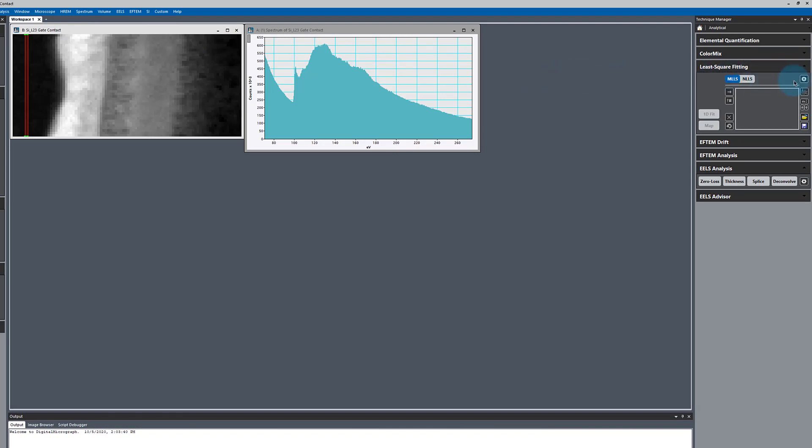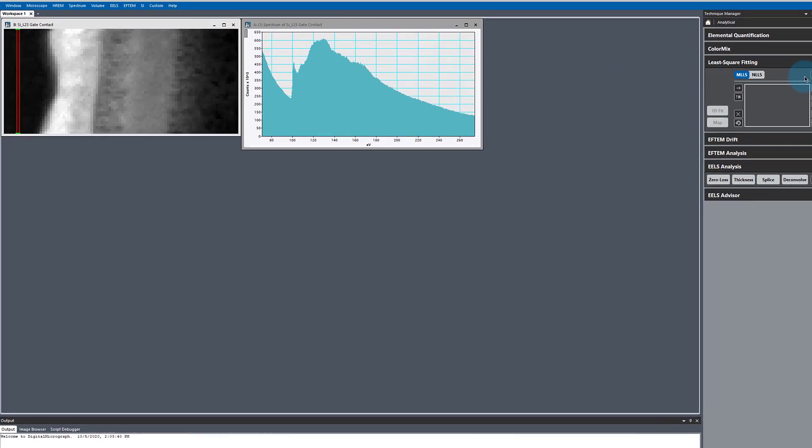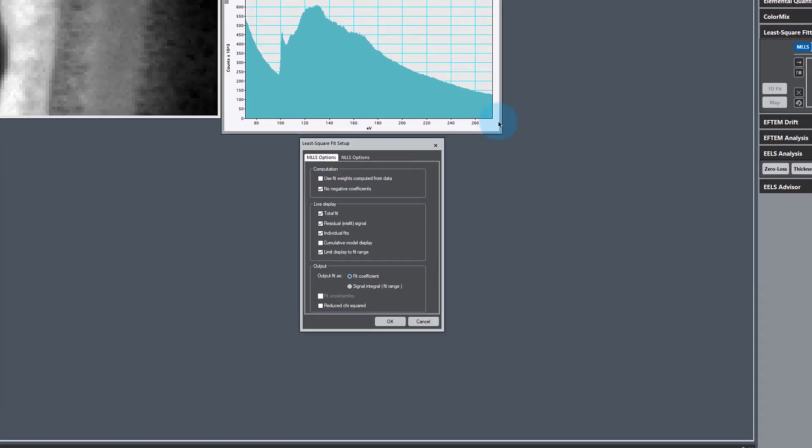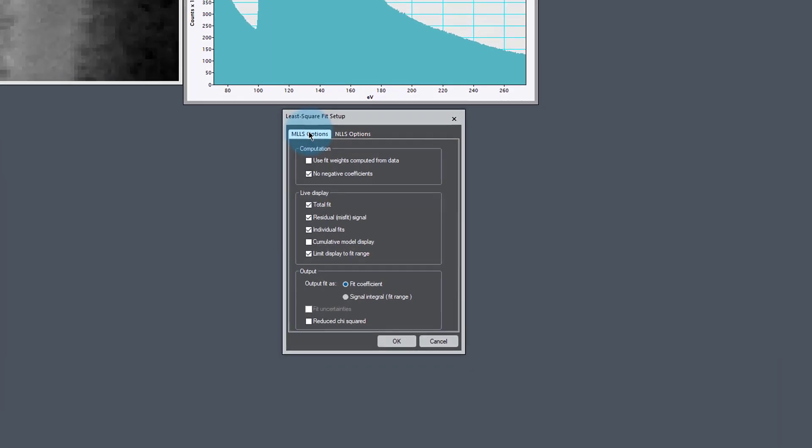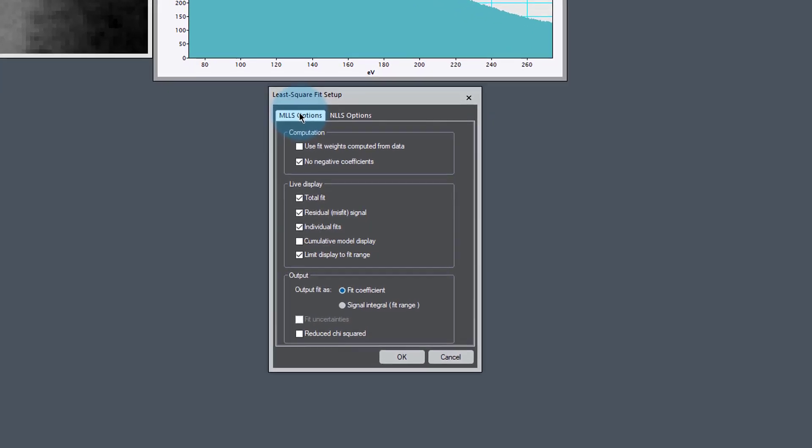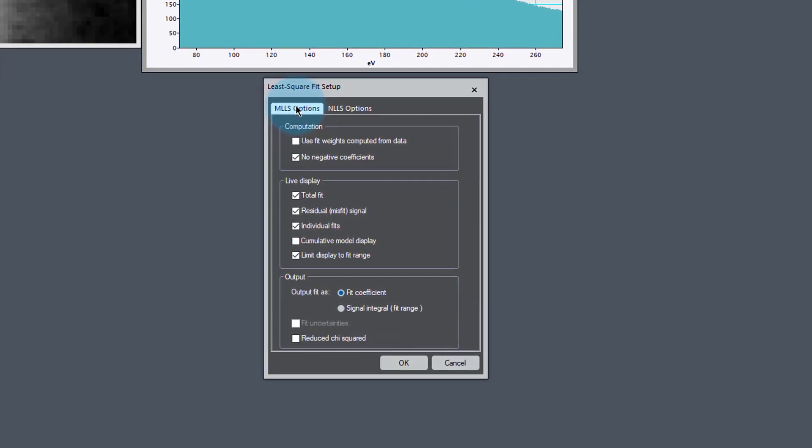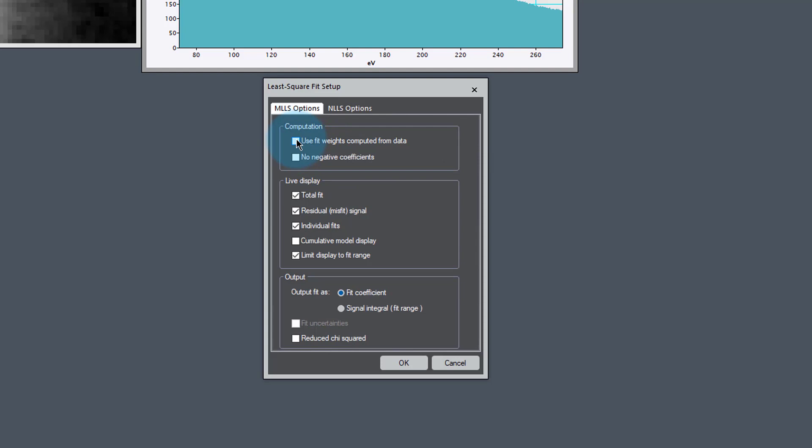Before we start doing any fitting, let's take a look at the parameters. The parameters are in this setup sprocket, and here are the options for MLLS Fitting. These should be the default options, unless you've already been doing MLLS Fitting. Under Computation, there's two important categories: one is to use fits, and the other is to use negative coefficients. Unfortunately, we can't do both at the same time due to limitations of our fitting libraries.